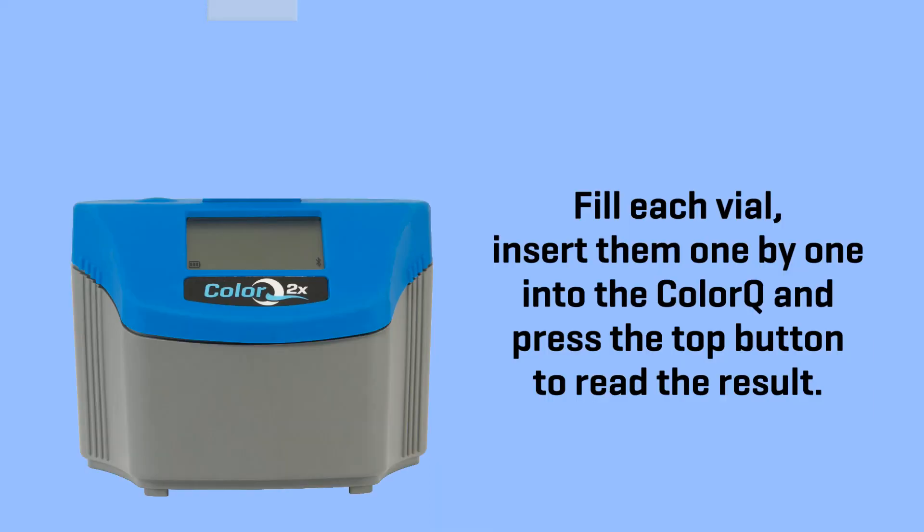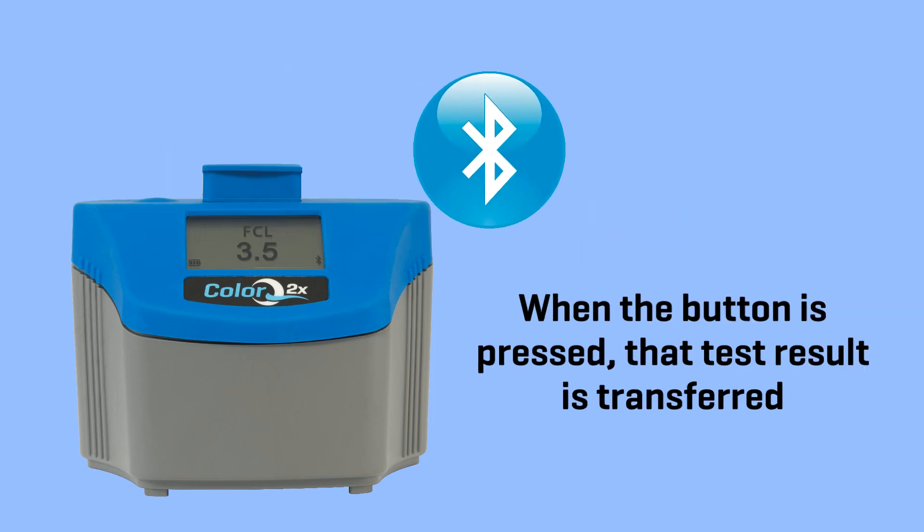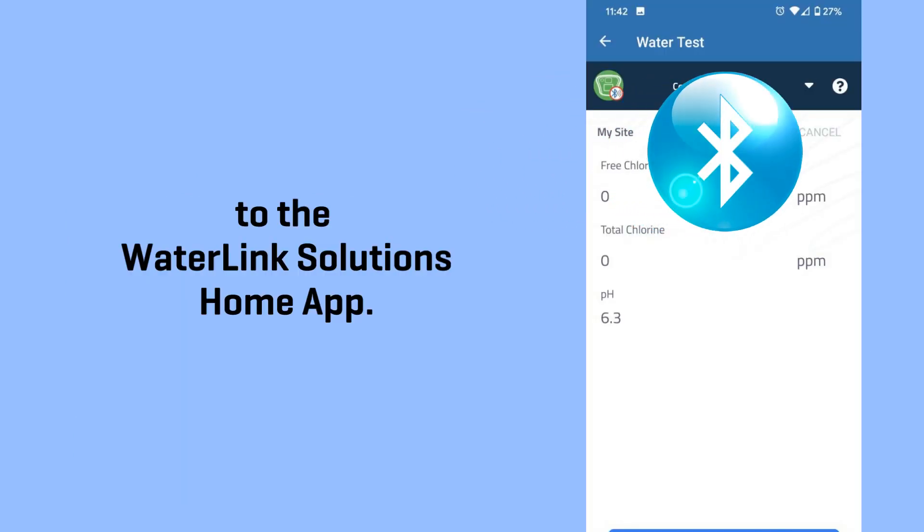Fill each vial, insert them one by one into the ColorQ, and press the top button to read the result. When the button is pressed, that test result is transferred to the WaterLink Solutions Home app.